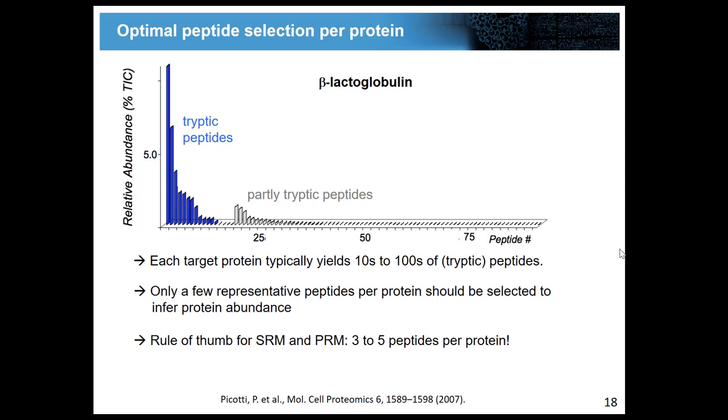What do you think of those ones up here? Which one would you choose? The big ones. Yeah. Protein specific. Protein specific. Mm-hmm. Nice, exactly, the big ones, the intense ones, exactly, here we have intensity on that axis. Yeah, you're right. So that's exactly what people do.